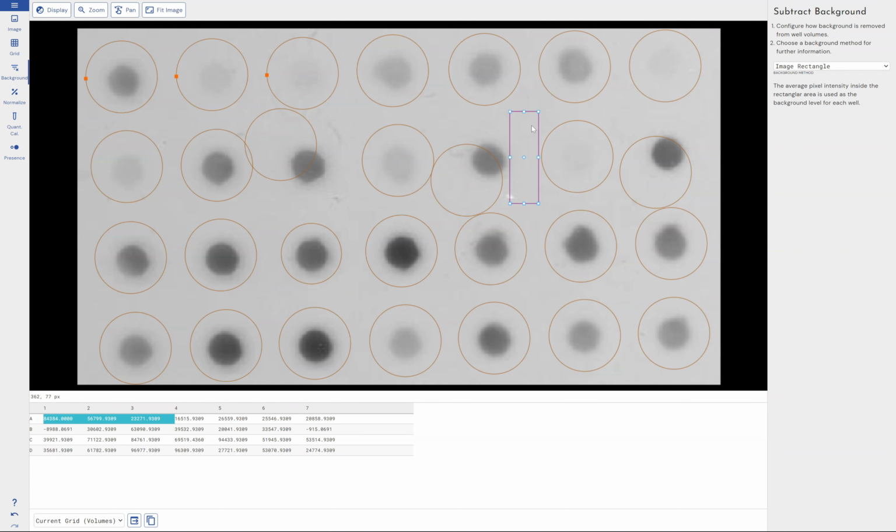Constant background removal values, and I've talked about this in Phoretix 1D, are risky because they assume that across your image, top to bottom, left to right, your background is all the same, it's completely universal. So you can just take the same value from everything, from every XY position in the image, it will be the same. And that's very rarely the case in an experiment.